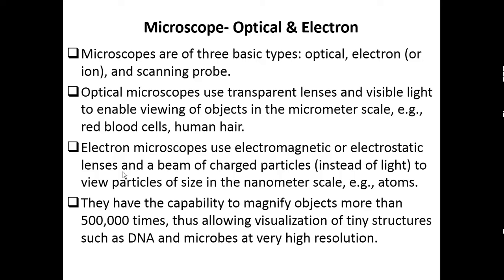So optical microscope is actually used in order to study the material or its characterization, when the image is magnified to many times, isn't it? So that is the optical microscopy. So optical microscopy means we can have a microscope, either a single microscope or a compound microscope. Both are possible with optical microscope.